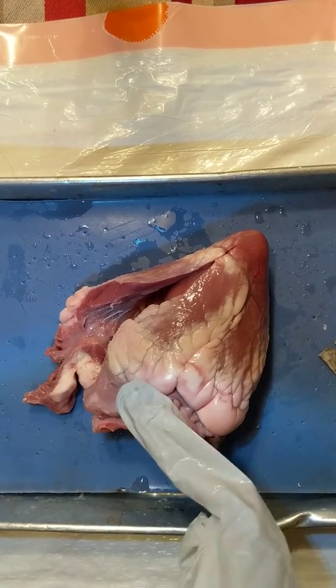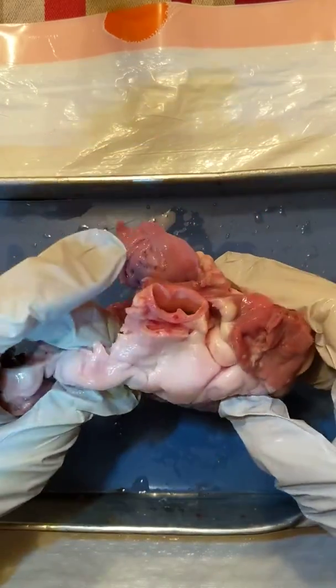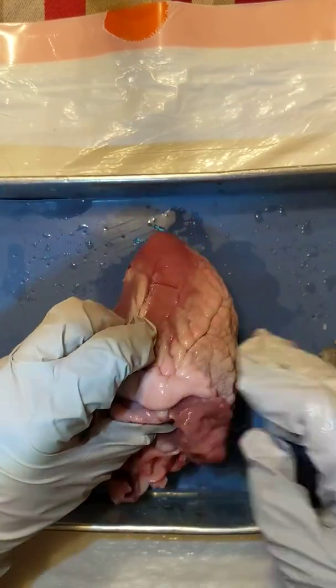All right, so we did the right side of the heart, now we are going to do the left side of the heart. Once I get my glove back on — I can't do my phone with my gloves on, that would make life a lot easier. All right, so now we are going to cut open the left side of the heart.